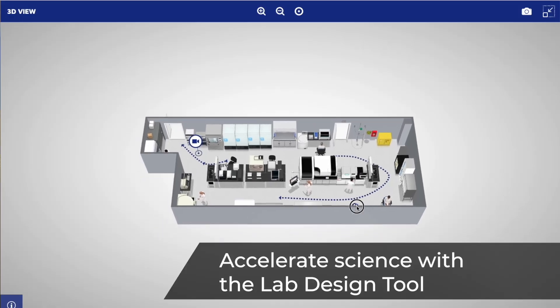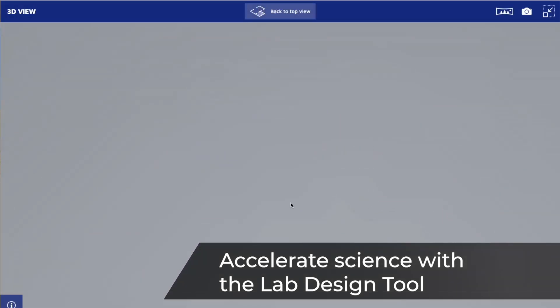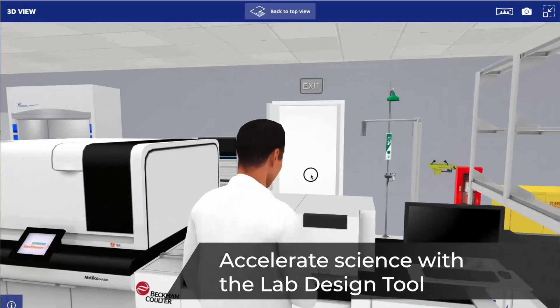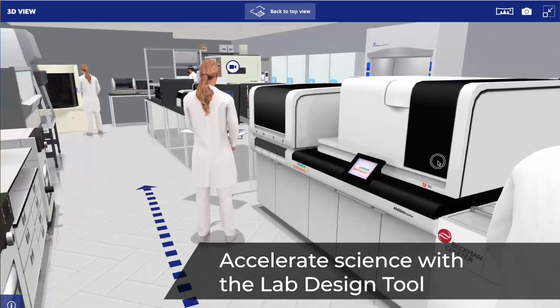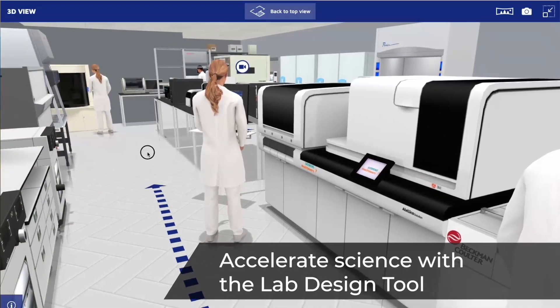Transform lab planning. Design smarter, work faster, and accelerate innovation.